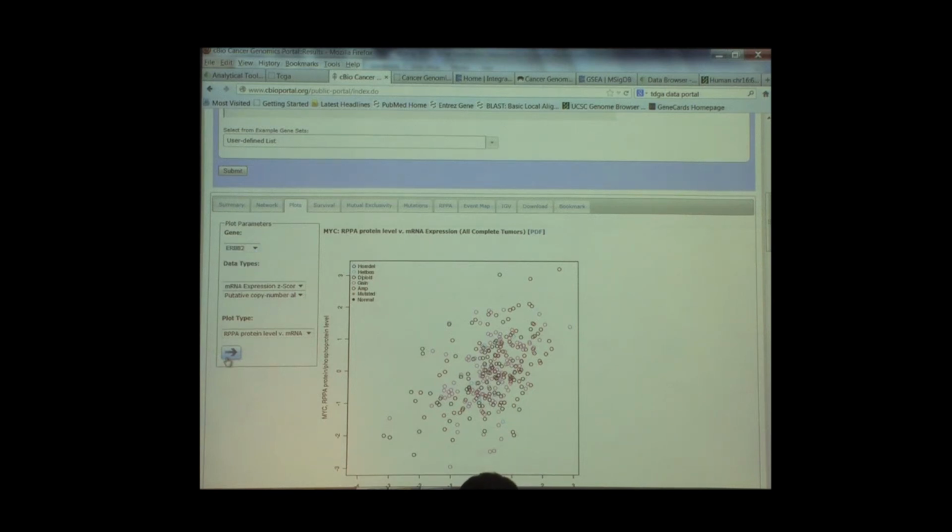But you can then take, this one is going to give you a funky correlation. If you were to run a Pearson's correlation coefficient, this would actually give you a correlation because it's going to be driven by these outliers up here, but that really isn't correlated. Okay, this is protein level to mRNA level.